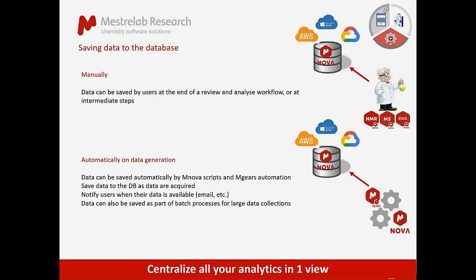And the data can be saved manually. So when you finish each analysis, you have an Mnova document, you save it to the database, or it can also be saved automatically by running, for example, an automation, an MGears automation. So we have automation capabilities for that as well.